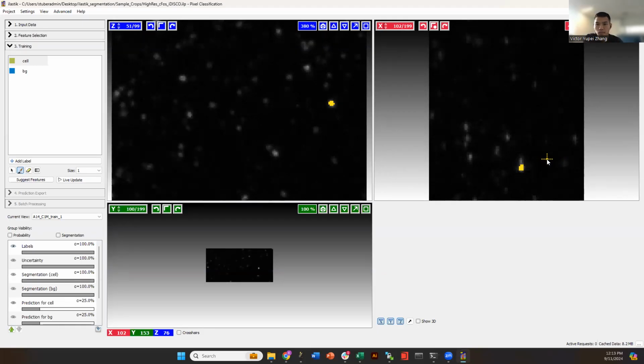So that is a totally separate conversation or question: how does an experimenter define a cell? Because you cannot go away from that question when you do something like this. The classifier will only be reflecting what the experimenter thought was a cell. If your images are more ambiguous and you can't define what a cell is, you shouldn't be doing this part yet, or any kind of spot detection part. You at least have a ground foundation, or a belief of what you think a cell is, and don't move around from that.